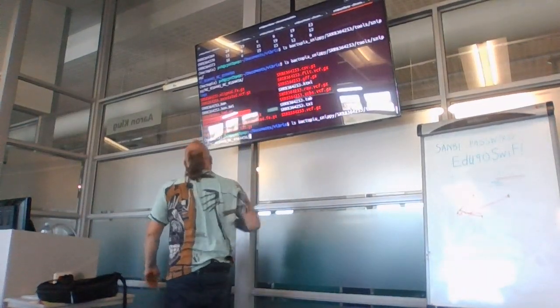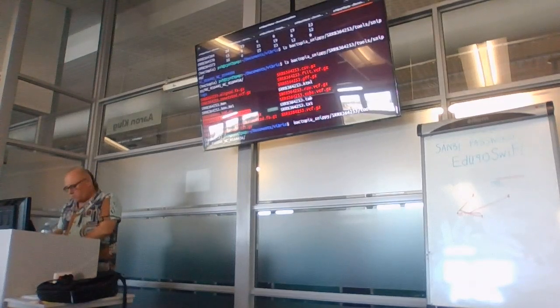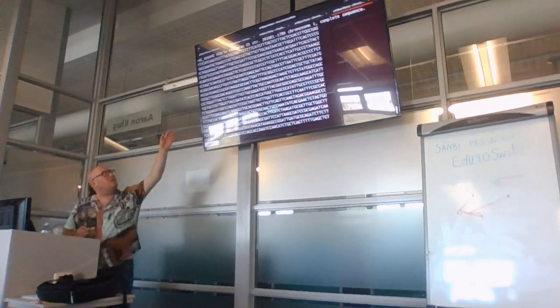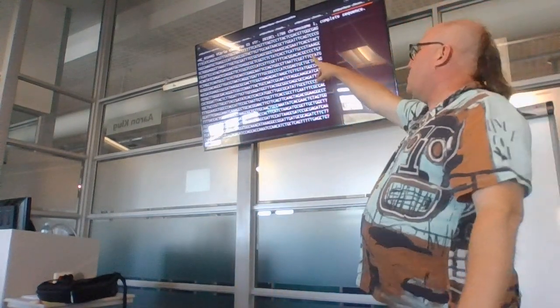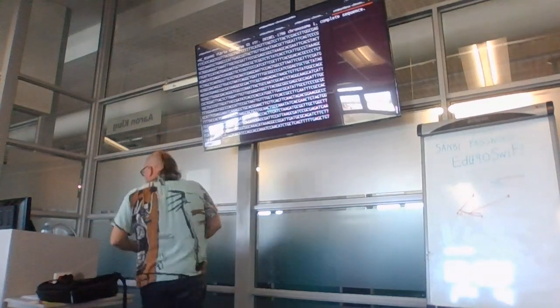It's gzip, okay? Which means that I cannot use more or cat to look at it. If I try to look at it with more, I get junk, but I can use a tool called zmore, which unzips it, and then I can look at it, okay? So here's my consensus. Unfortunately, it's kept the name of the reference there at the top, NC016445, okay? And I can also use zcat to look at it. So I wrote a little script, which I will share with you.